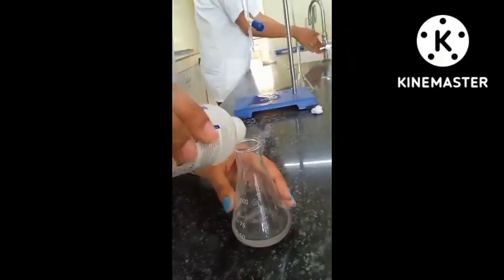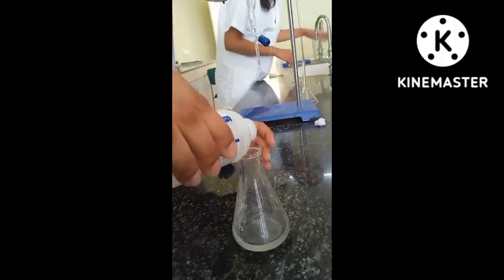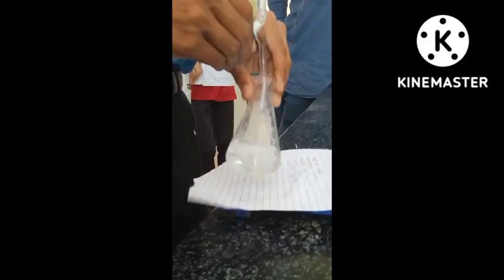So this is phenolphthalein as indicator, and we had added some drops of phenolphthalein in the oxalic acid. Here you can see that no reaction is there, no pink color is there. As we all know, indicator doesn't react with the acid. That's why it is colorless.